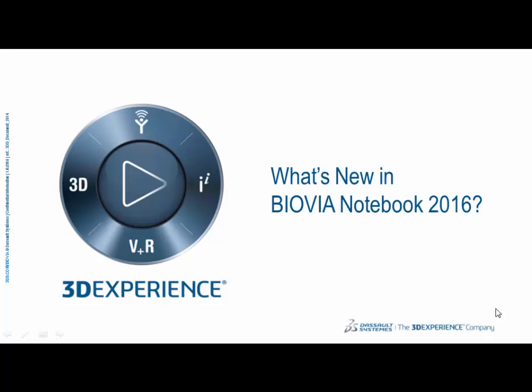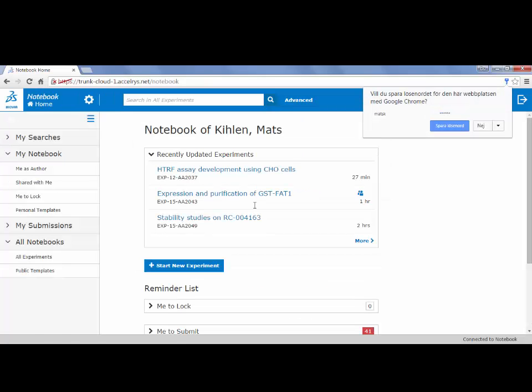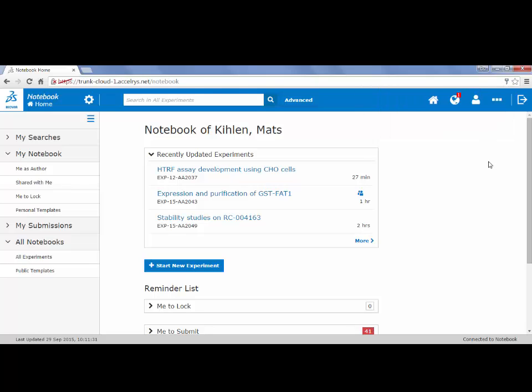This is an introduction video for current users of the system, rather than a training video for new users. The aim is to give you an overview of the new interface and some of the features that will be available in a 2016 release.